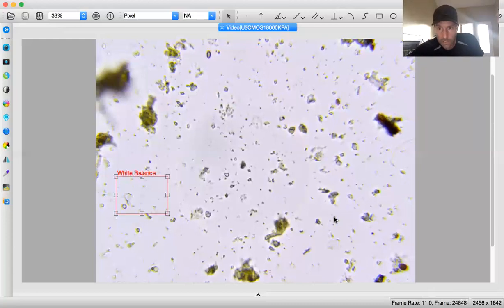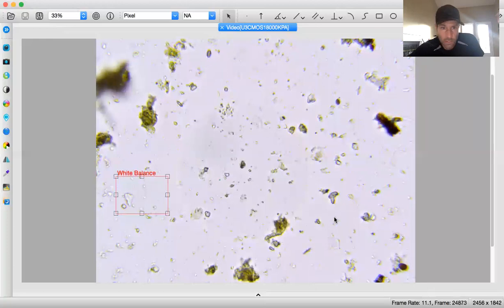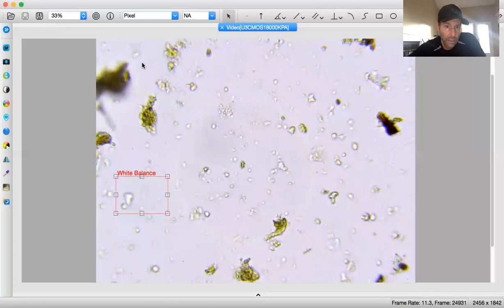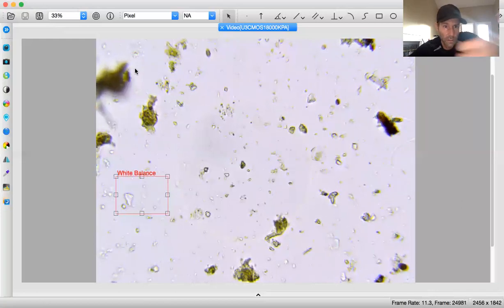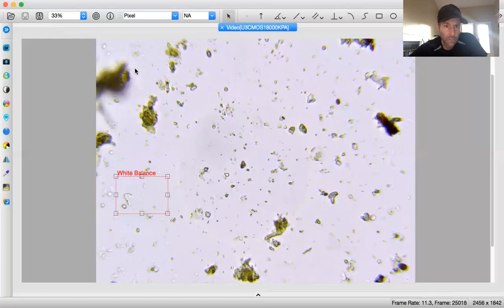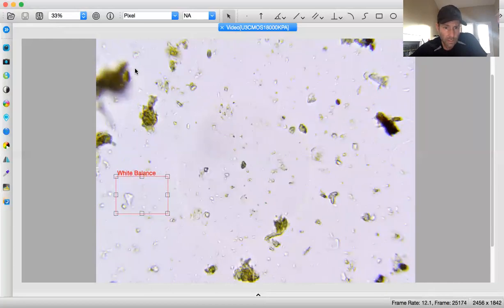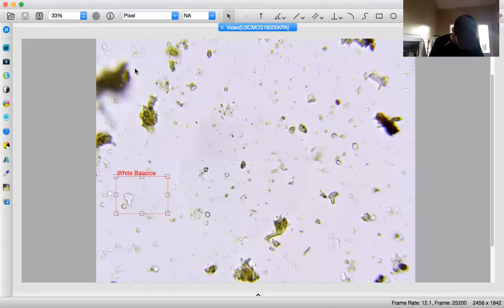Okay. Anything else to record? Ooh, I see a little more actino up here. Boy, that's a hair of actino. I'm going to call that a 1 as well, a 0.1. Oh, might have a little bit, no organic matter, no filament. It is not filamentous. So we are going to go with that as our actino, and I'm putting down another 0.1.